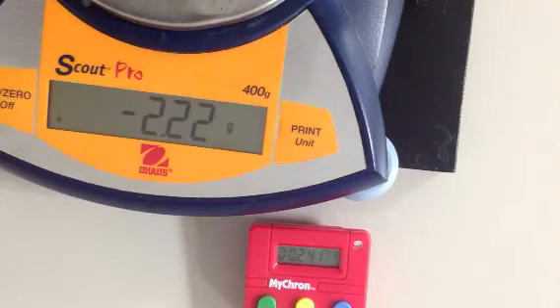Meanwhile, we're still losing mass. Are we still losing mass as fast as we were? No. Okay. So we can see the rate of the reaction is changing, and if I'm savvy enough, I will be able to send this video to all of you, and you will be able to use it. You can see the rate right now. Has the mass changed? Let's see. Okay, it's 3 minutes now. In 1 minute, we'll see if the mass has changed, and if it hasn't changed much, even, we'll say we're done. Do you think the mass is still changing?